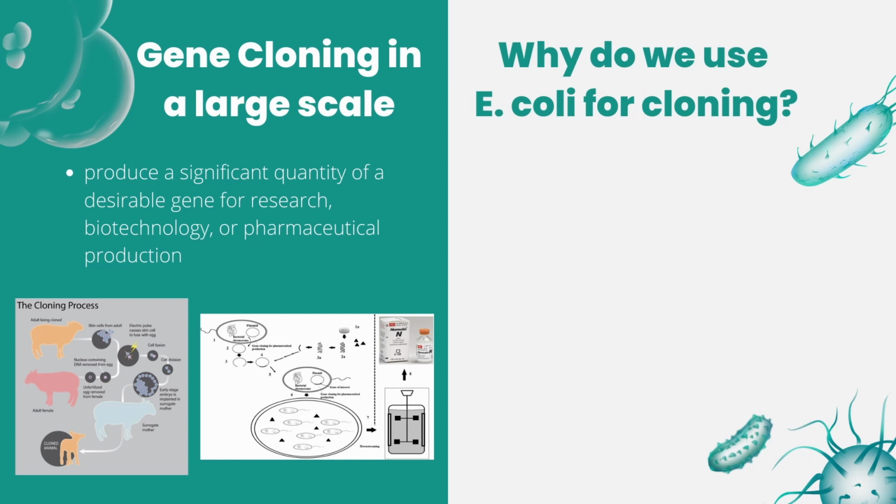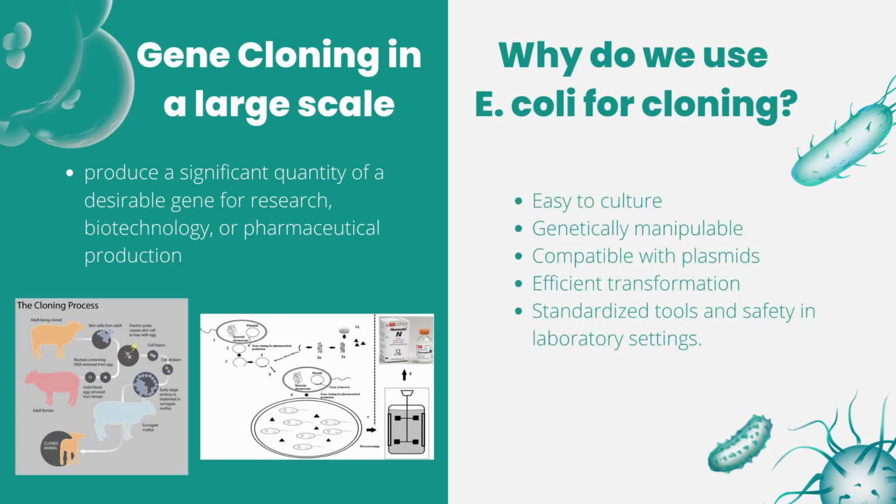Why do we use E. coli to clone genes? E. coli is the most frequently used host for the production of enzymes and other proteins by recombinant DNA technology. It is commonly used for gene cloning because it is easy to culture, genetically manipulable, compatible with plasmids, has efficient transformation, and offers standardized tools and safety in laboratory settings.